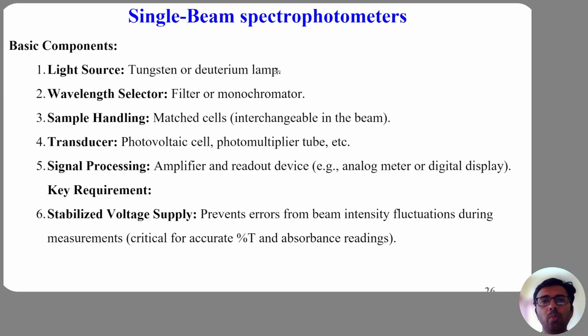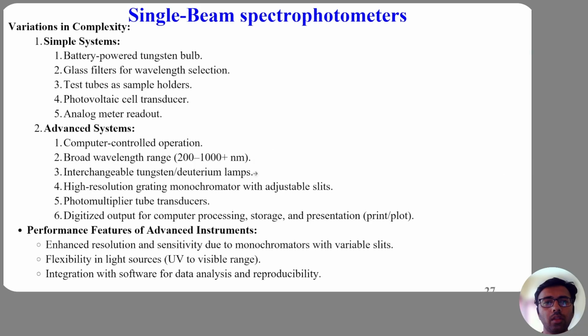But before moving ahead, let us examine variations of single beam instruments. Single beam instruments exist across a wide spectrum of complexity.